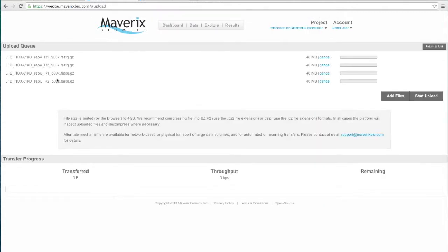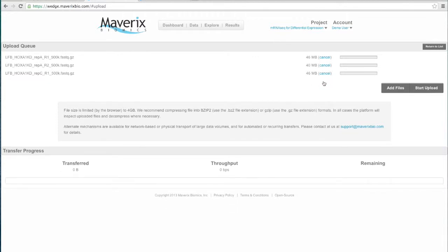Once your files are queued over here, you could go back and make sure that you've added all the ones you want. If you didn't want to upload a file, you could just cancel from here. And once you've queued all the files that you want to upload, you would just click Start Upload. These will upload directly to the secure cloud account that's behind your particular platform account. And then what that does is allow that data to be associated with your project here, as well as securely stored within your cloud account.